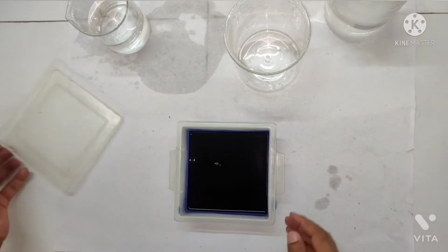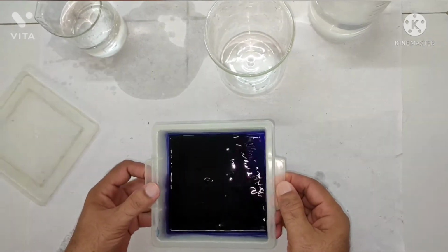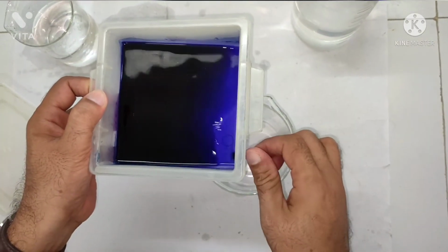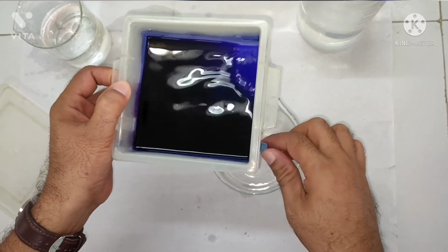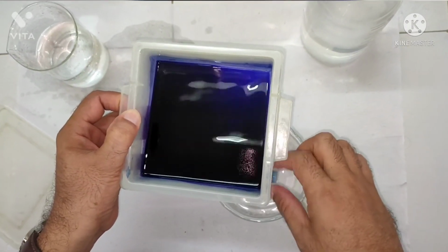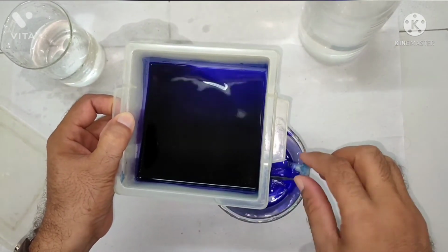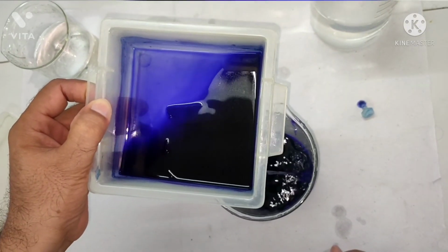Now this is the gel after overnight incubation in the staining solution. So now I am pouring out the staining solution, right? And then we wash it with simple double distilled water, and then we put the destaining solution, right? So I am just opening this. This is the staining solution, and the staining solution is coming out.